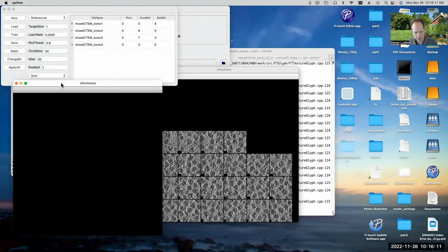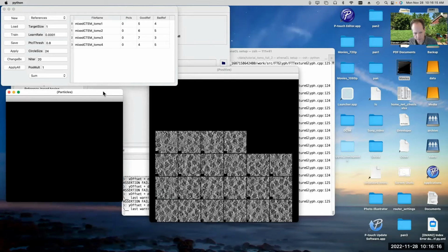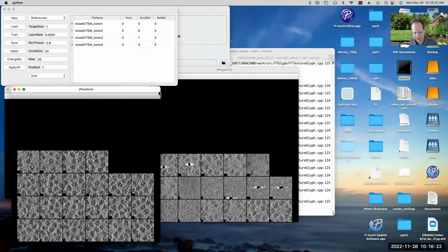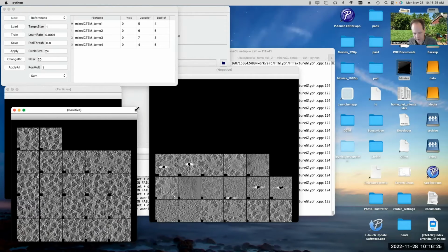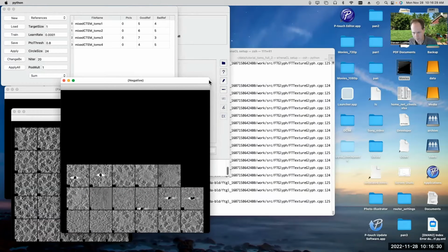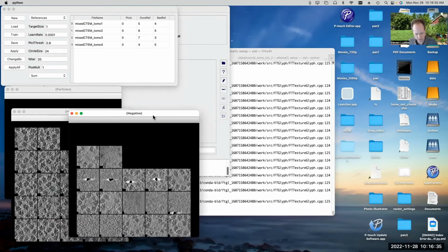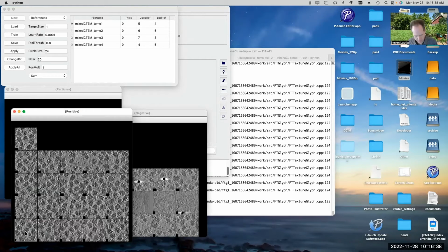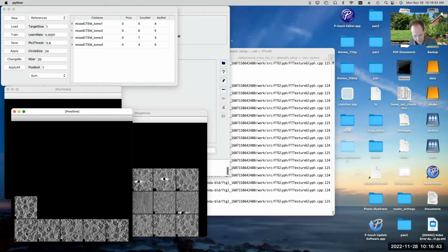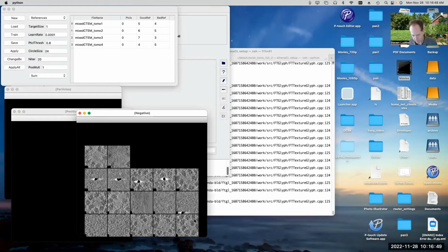Okay. So we've got a bunch of windows here. We've got a particles window, and we want to get these arranged the first time we do this. We've got a positive window. And it looks like I didn't get rid of my previous positive examples when I did this, so I still have some positive and negative examples here. It's interesting. I thought I'd removed the files which contain this info. I'm just deleting all of the examples here manually, just for speed, just to show you what it'll look like normally when we start.